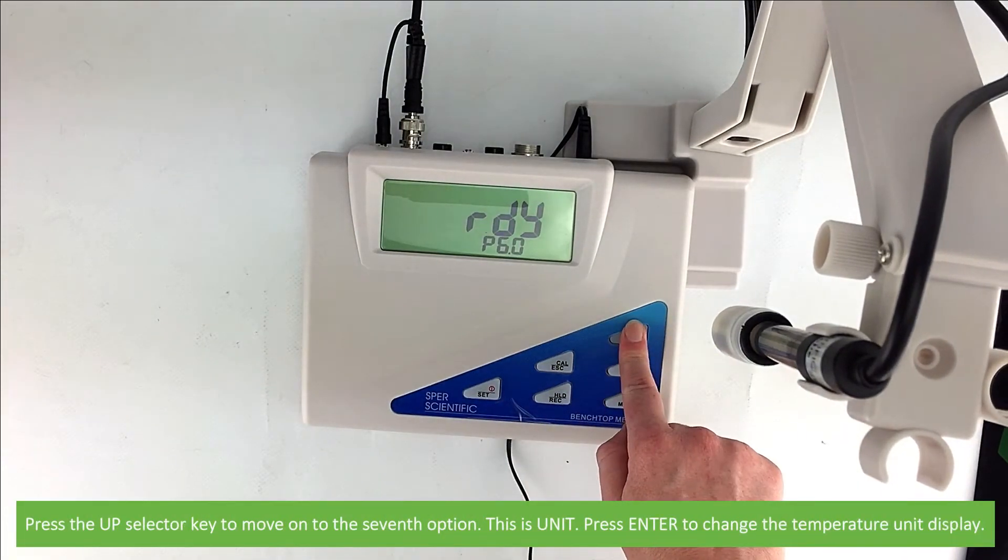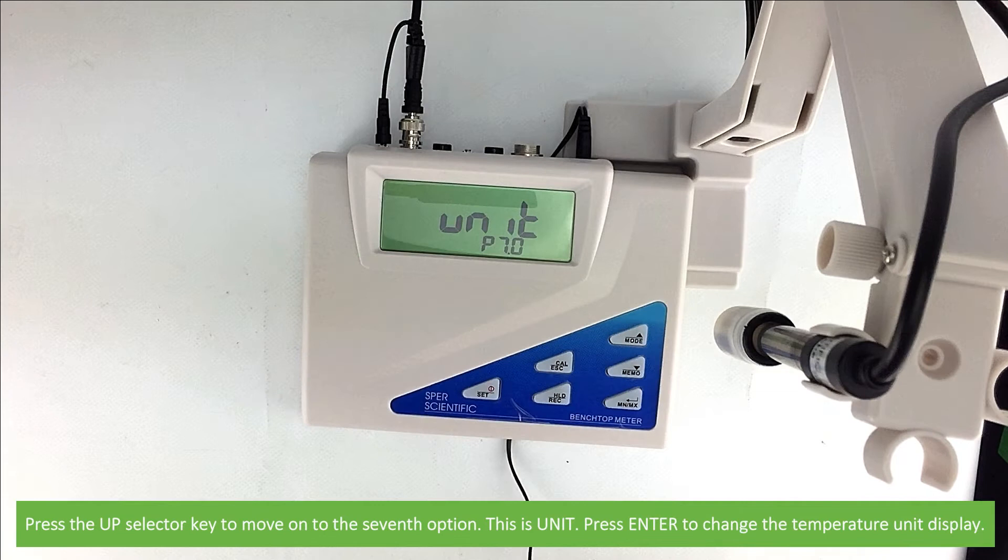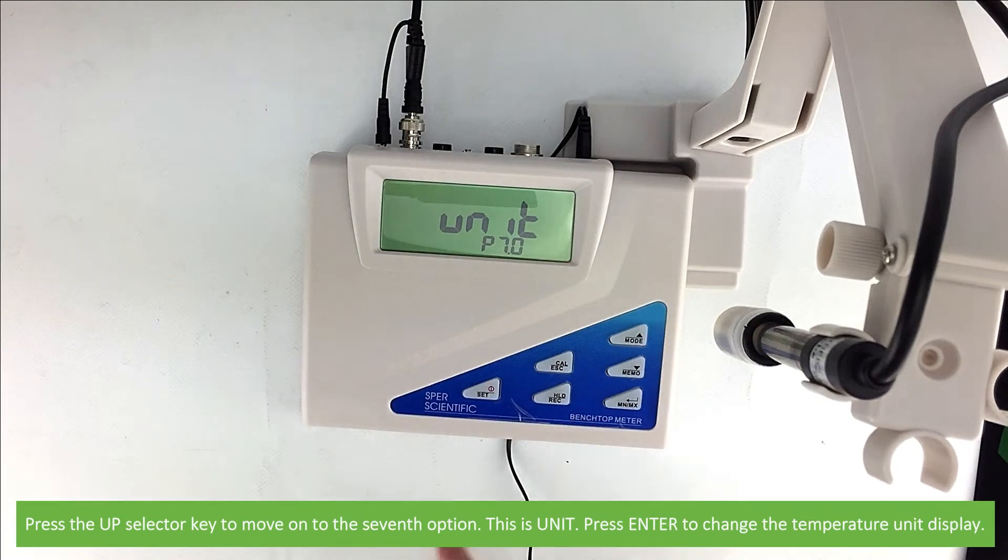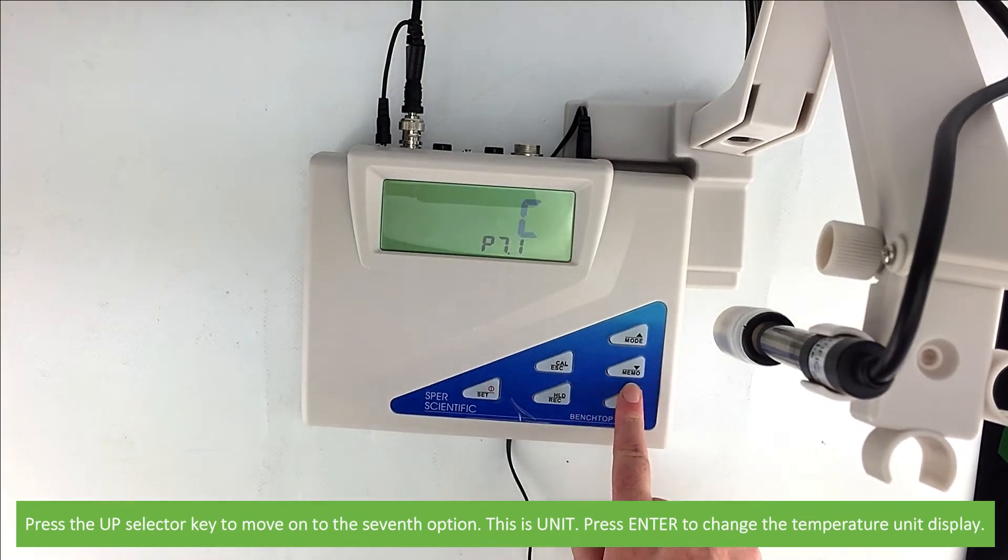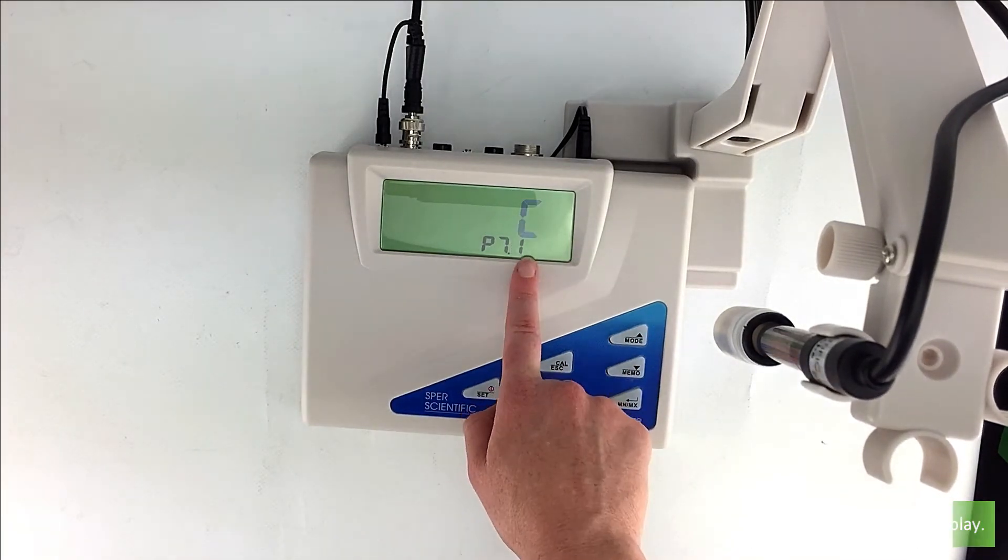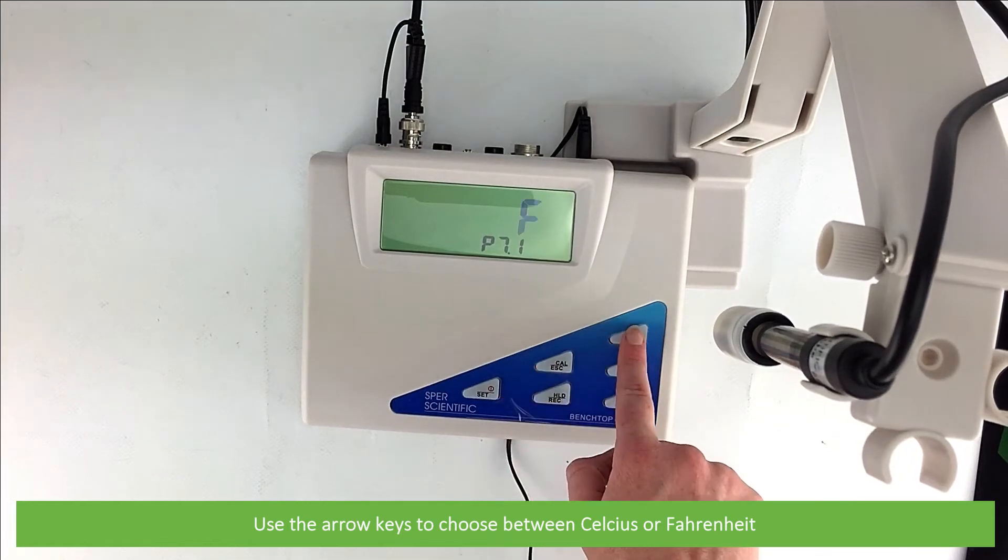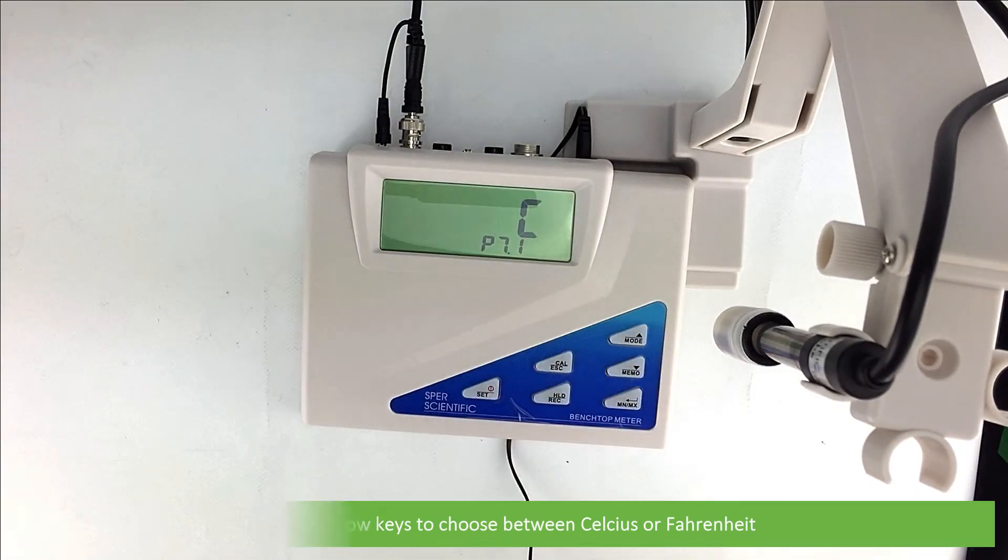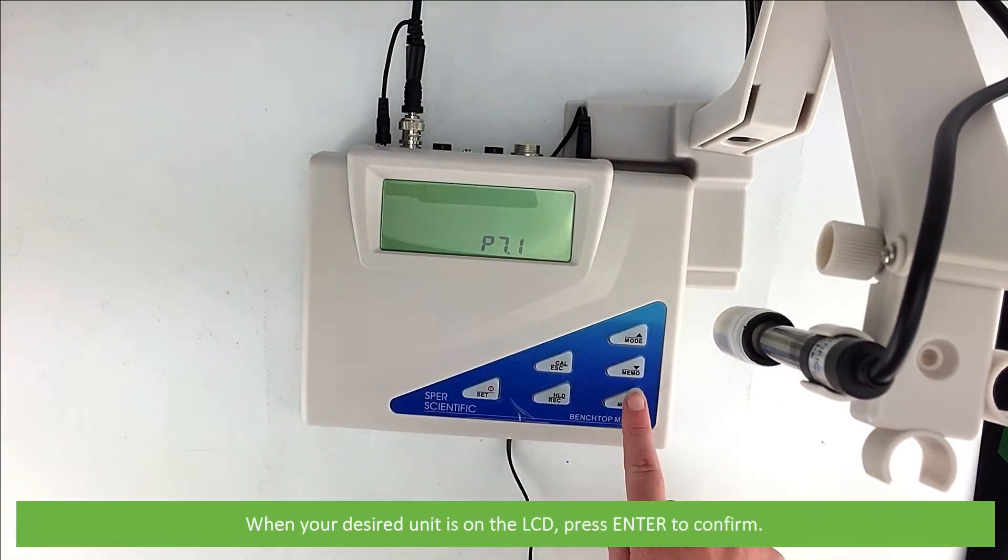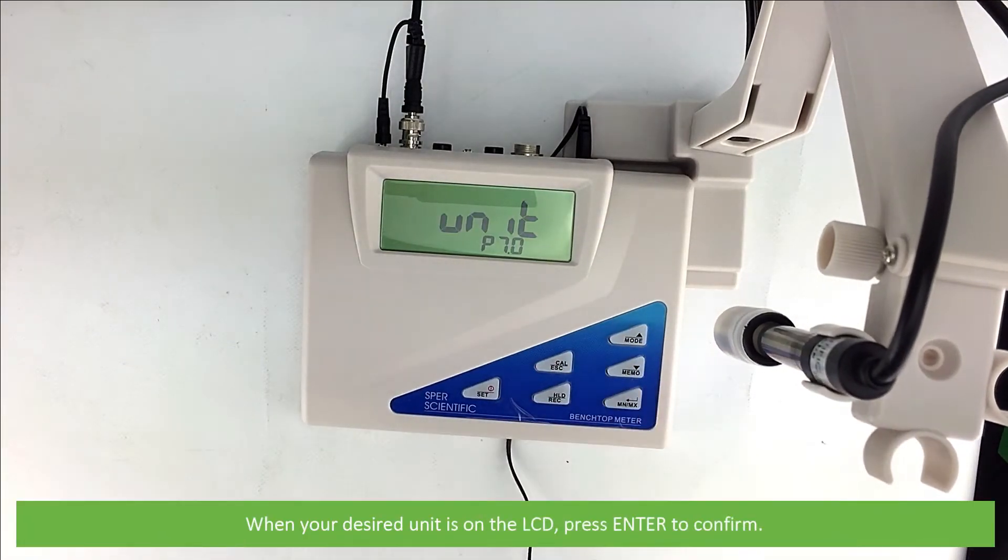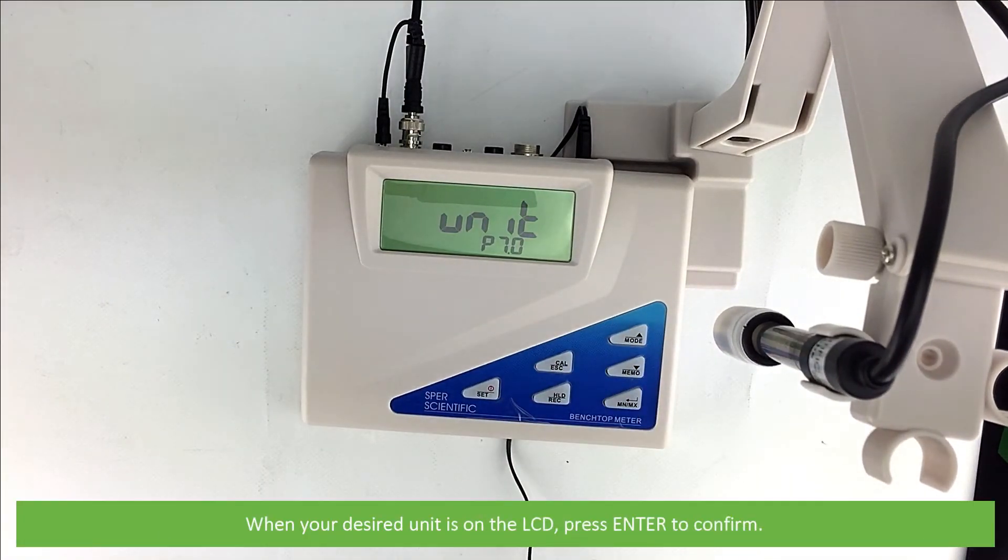Press the up selector key to move on to the seventh option. This is unit. Press enter to change the temperature unit display. Then use the arrow keys to choose between Celsius or Fahrenheit. When your desired unit is on the LCD, press enter to confirm.